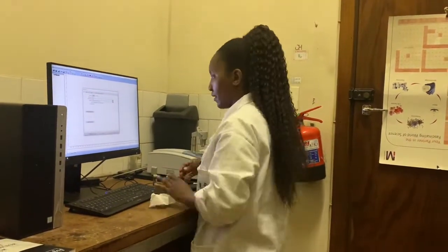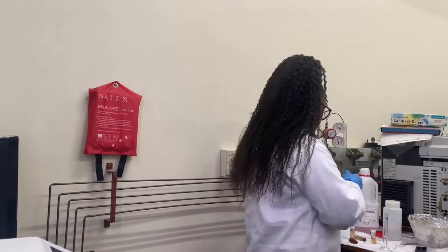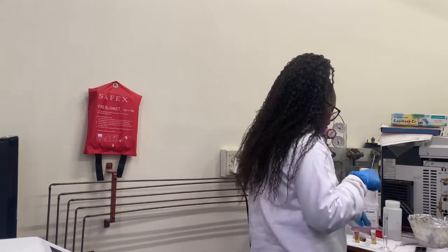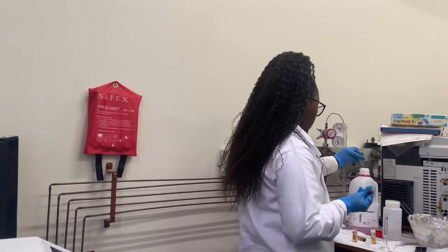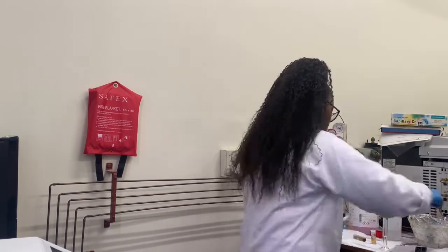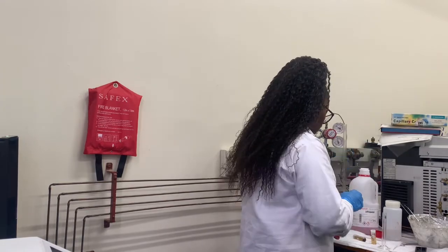So here I was using the UV spectra. Interestingly, porphyrin has a shape that you can only see with porphyrin. That is a fingerprint shape of the porphyrin, whereby it has 4 Q bands and 1 Soret band.